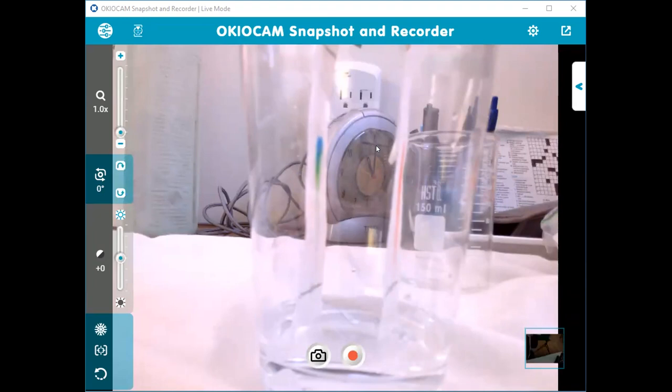These guys, 1, 2, 3, 4, 5, 6. The actual water line is not the same as the original finish line that you originally marked, and that is okay.